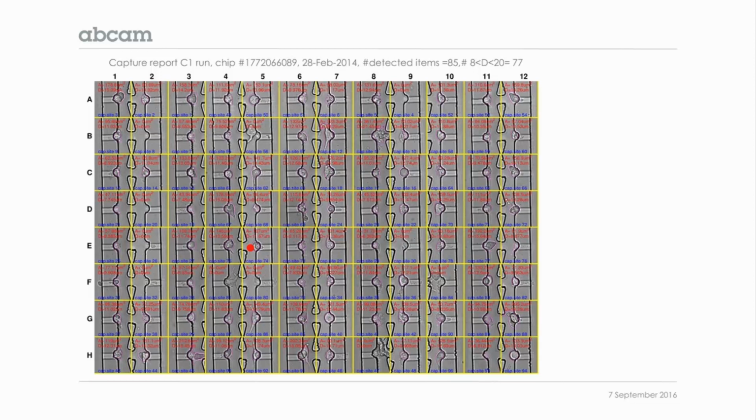What you do is load into this fluidic chip a cell suspension, which is what you have after you dissociate the tissue, with a concentration of a few hundred cells per microliter. You load about 5 to 10 microliters into the chip, and the machine pushes those cells into the microfluidics channel. This process takes about 30 minutes. Then you image this chip, and you see whether the cells got captured or didn't get captured, or how many got captured.